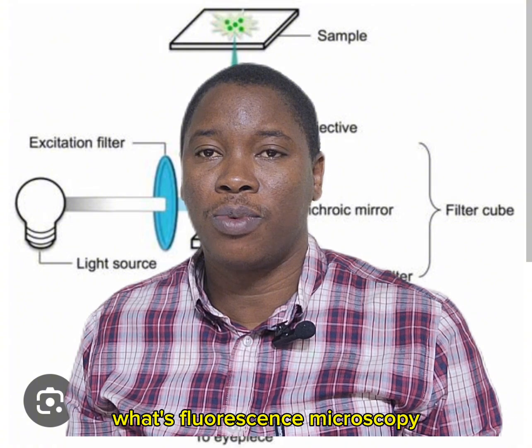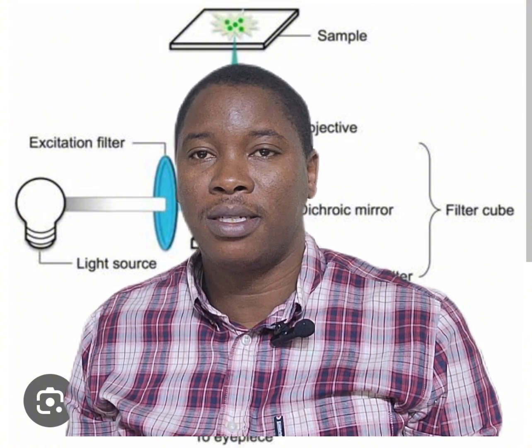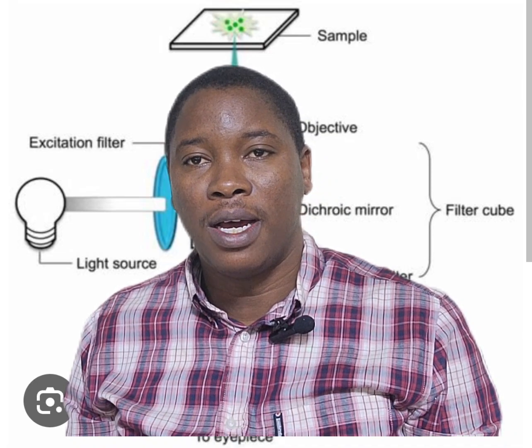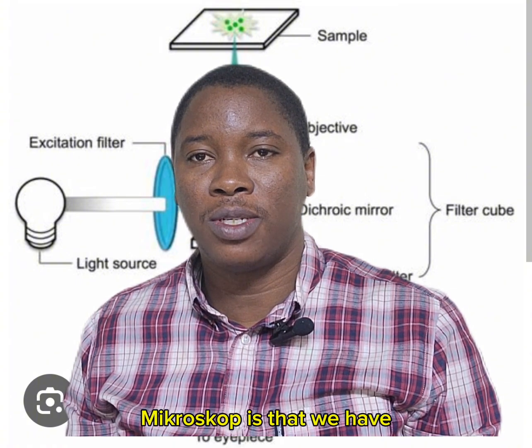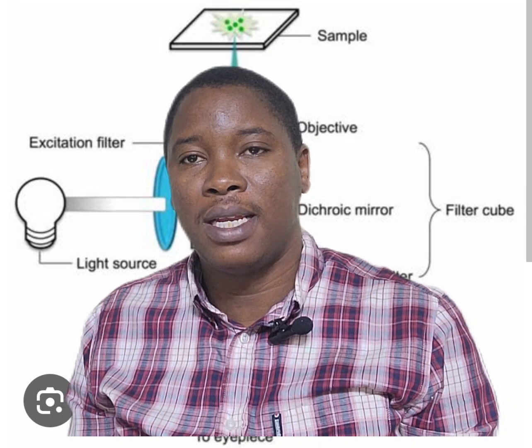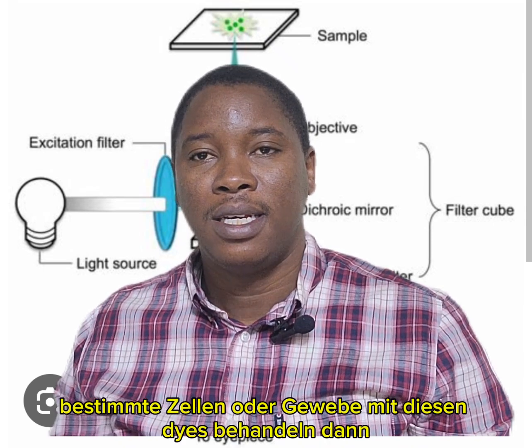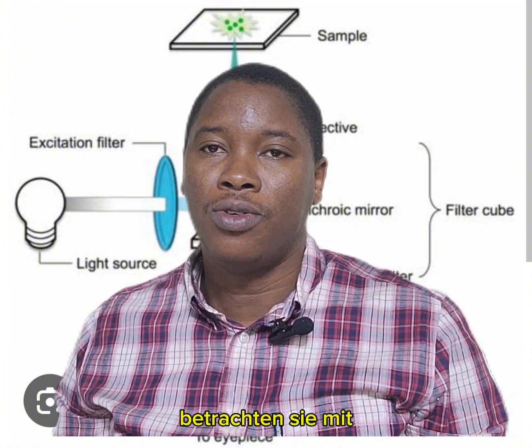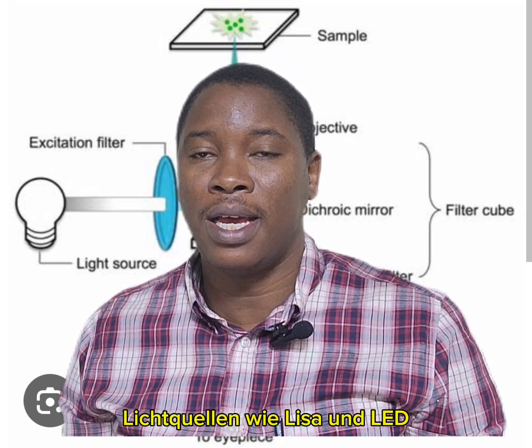Fluorescence microscopy is a method of examining living cells, tissues, and organs using the principle of fluorescence. The idea is that we have dyes that we call fluorescence dyes, and when we stain particular cells or tissues with these dyes, we mount them on the microscope and view them using different kinds of light sources, like a laser or LED.